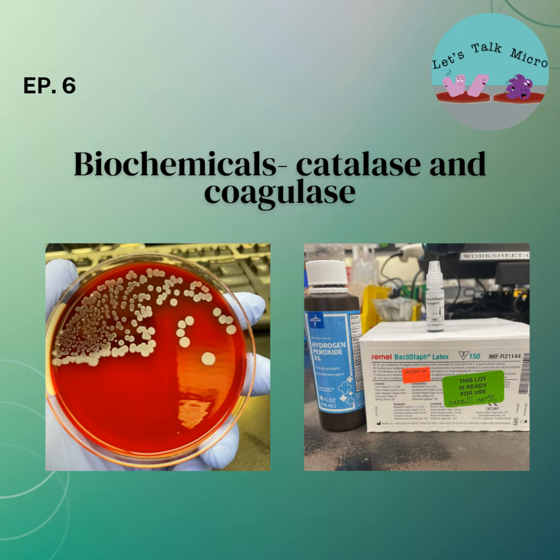So what happens when your catalase is negative? What's the next step? We know that with catalase positive, we think we have a staph. We do a coagulase, then we separate Staph aureus from coagulase negative staph. So what if we have a strep? What do we do? Well, that's going to be on the next episode. I don't want to overwhelm you with too many biochemicals.